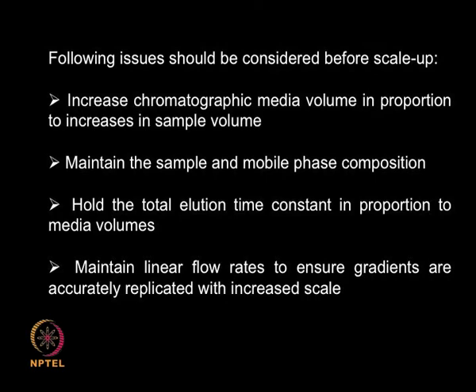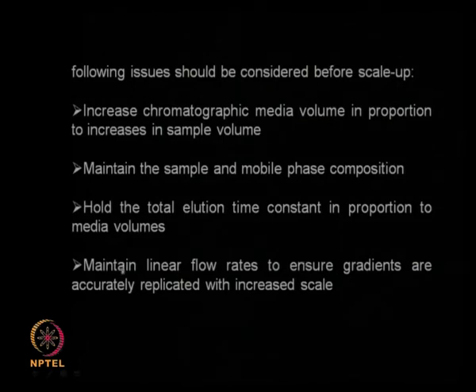Then I would like to maintain the same elution time. If I am doing a protein purification in the lab and my elution time is 35 minutes, I do not want to be running for hours if I am going to scale up. I want to see whether I can achieve the same elution time, that means the same 35 minutes. So if I am going to increase the media volume, how much is the elution time going to change? I need to consider that aspect also.